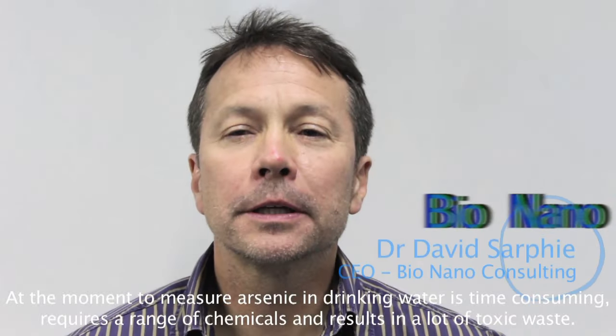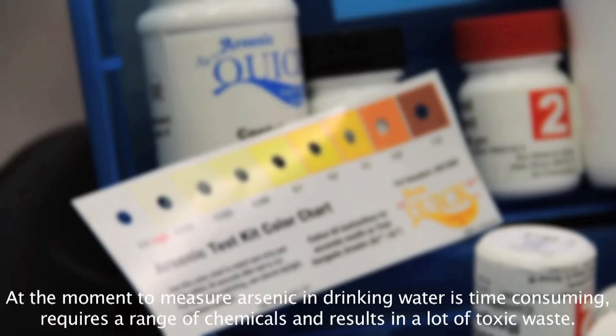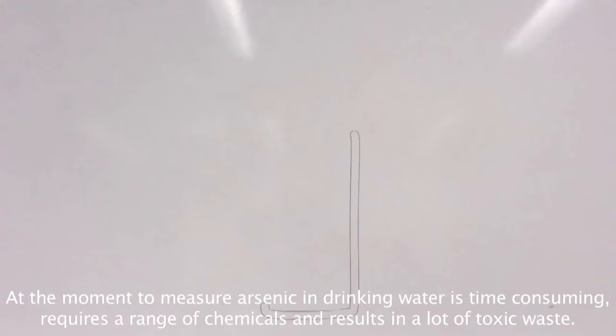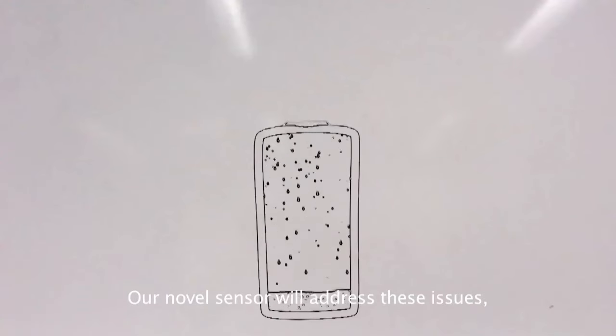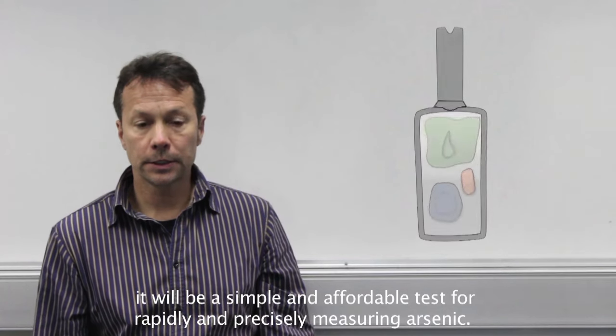At the moment, to measure arsenic in drinking water is time-consuming, requires a range of chemicals and results in a lot of toxic waste. Our novel sensor will address these issues. It will be a simple and affordable test for rapidly and precisely measuring arsenic.